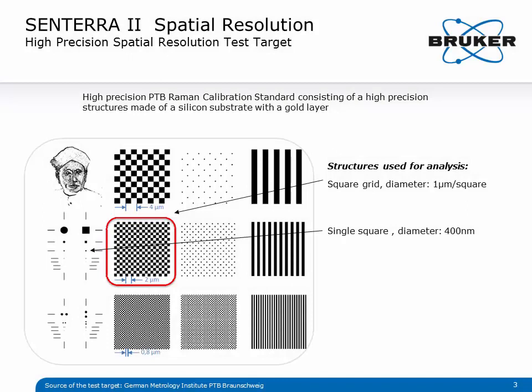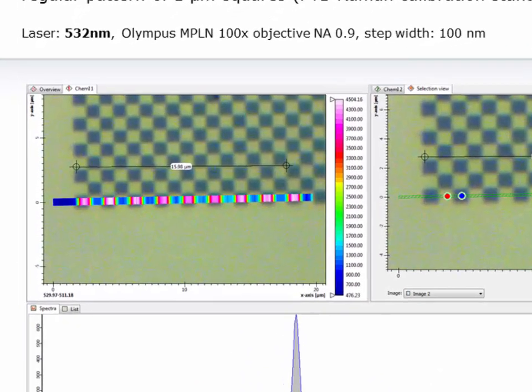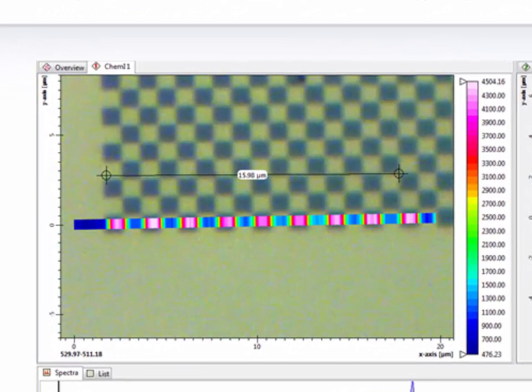To test this claim, we used a high-precision PTB Raman calibration standard made by the German Metrology Institute in Braunschweig. It consists of a silicon substrate with a gold layer that forms very fine and highly precise structures. This test is based on the silicon phonon band at 521 wavenumbers that is more intense in pure silicon areas and less intense in the gold layer areas. Each square is 1 by 1 µm.